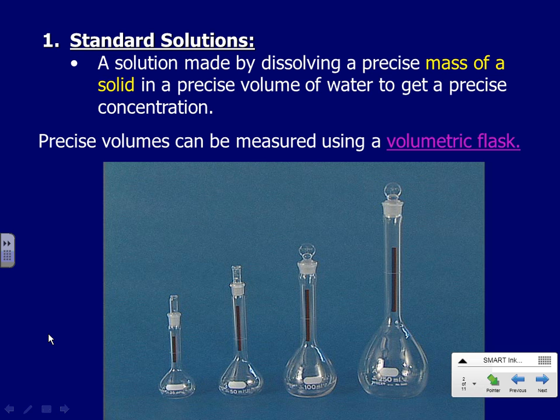Perhaps we can put the solid directly into a beaker, and then dissolve that solid in a very well-known volume of liquid. And if we've done all of our jobs very well, then we've created what we call a standard solution. It is a solution of well-known concentration.